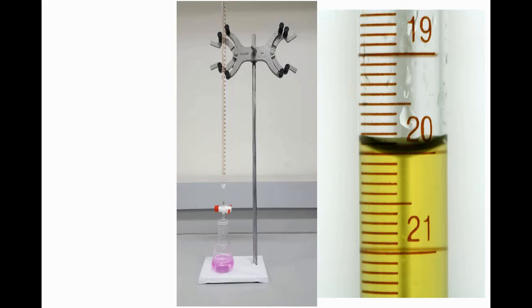So because the burette is designed to dispense liquid downward, the way the markings read is they increase as you go down. So notice this is marked at 20, this is marked at 21. And so what that means is you want to read at the meniscus. So here is my dip, this is my meniscus. So what this means is my starting volume is 20 milliliters. But let's say that my meniscus lowered all the way to maybe here, okay?